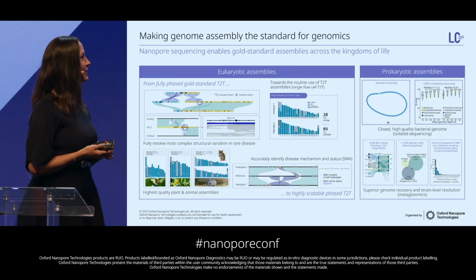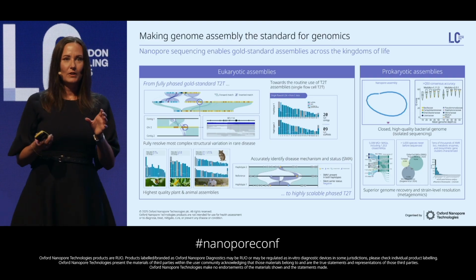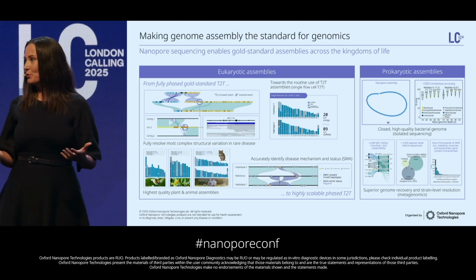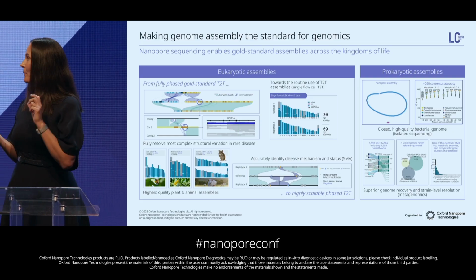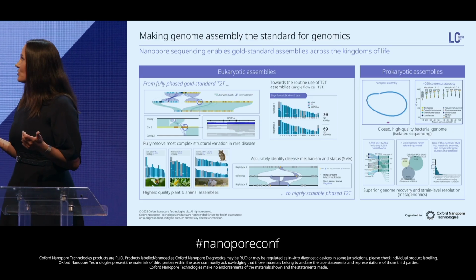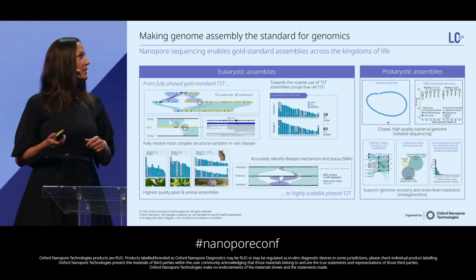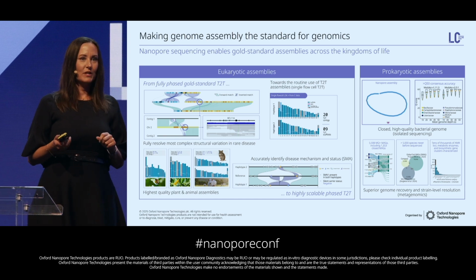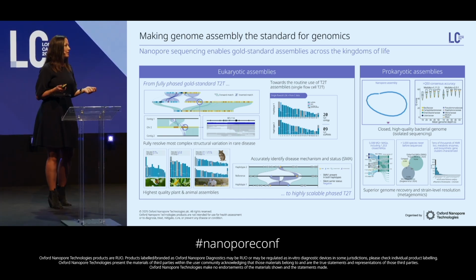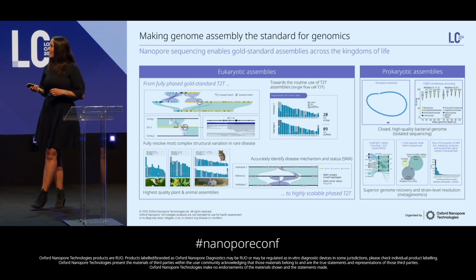So in terms of a summary, I hope we've convinced you that, 1, you can do assemblies to do a lot of the things that you would normally do with alignment-based approaches. This is true for both things like rare diseases, like Sean showed, and PopGen. It's true for plant and animals. We put a little hamster on there because we can also use it for things like in biopharma, like the CHO cell line, which isn't always what you think it might be.